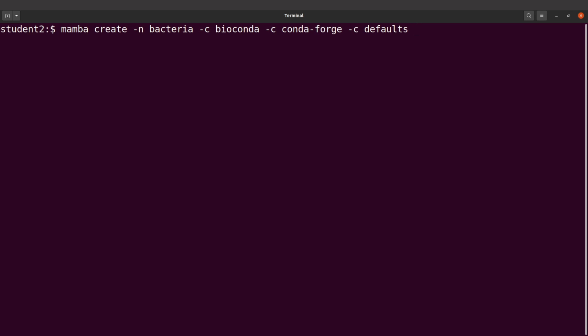So with the tools, we are going to use NanoPlot. This will be used for quality control of the raw reads. We will also use Filtlong. This will be used to filter the reads. And then we are also going to use Flye for genome assembly. I've covered an entire tutorial on that. We are also going to use QUAST to evaluate the genome assemblies.